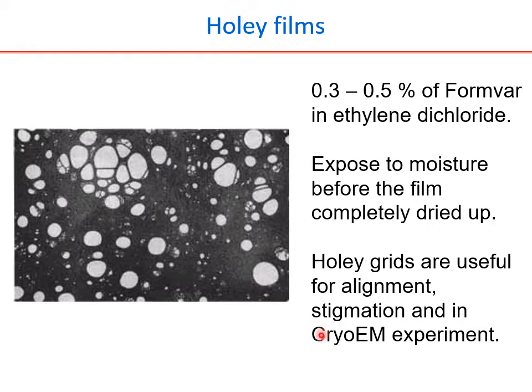And as I said, because of the irregularity of the shapes, this will be confined only to the screening of the cryo-EM experiment. But if you have patience enough, you can keep on searching for the holes of meaningful sizes and take the images. This only prevents us from going for automation. So if anyone has the patience to record by screening for the valuable or meaningful holes, Holey films still serve us as a better alternative for the cryo-EM experiment.